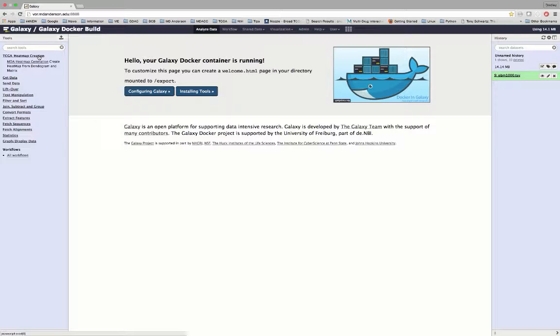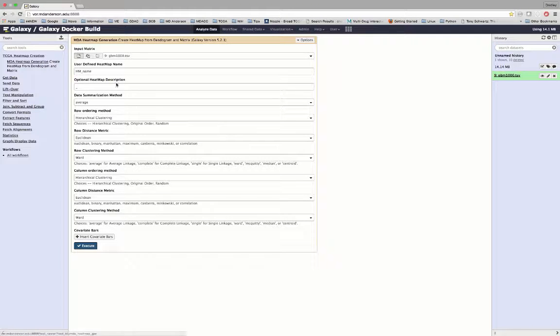We have recently created a new version of the NGCHM system that can be easily incorporated into Galaxy workflows. There is a Galaxy version of our NGCHM Builder tool. I am demonstrating that here using a data matrix that I have previously loaded into Galaxy. I will set an appropriate name for the NGCHM. After I'm satisfied with the settings, I'll go down to the bottom of the tool and start building the NGCHM.